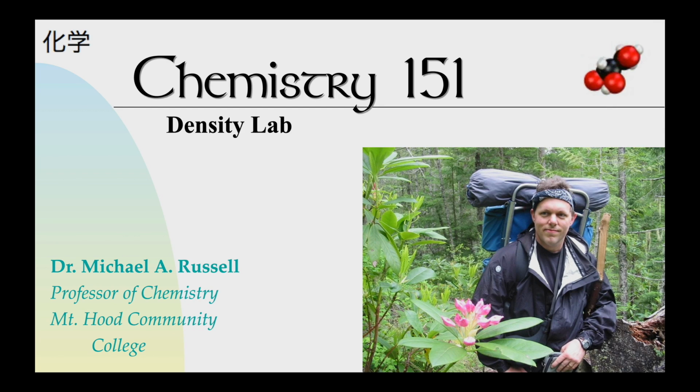Greetings and welcome to the Chemistry 151 Density Lab. We'll explore in this lab the relationship between the mass of an object and the volume of an object, and it should be a pretty cool experience.